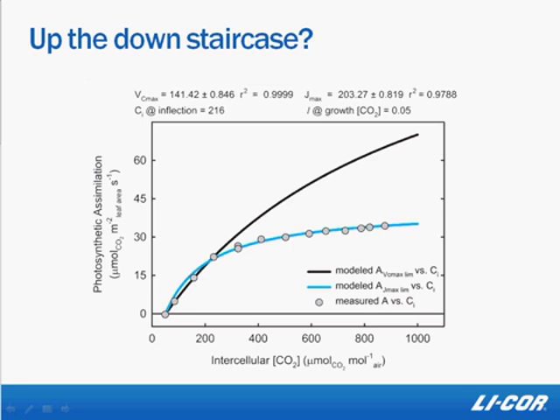Things to keep in mind, though, are that at higher CO2 concentration, the stomates close because there's plenty of CO2 in the environment and the plant can reduce possible water loss but still take in plenty of CO2. So it just kind of relaxes a little bit.